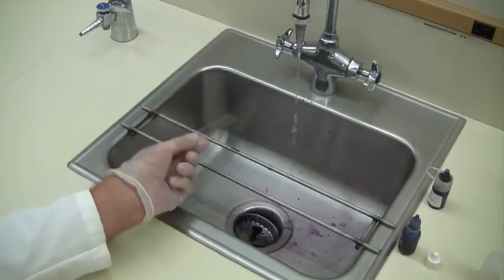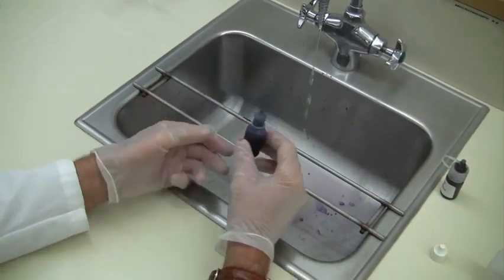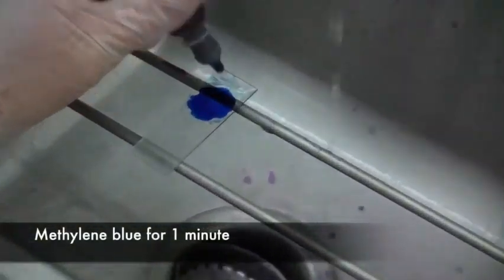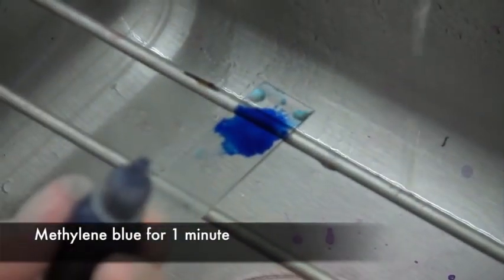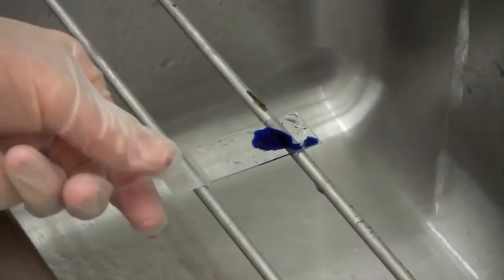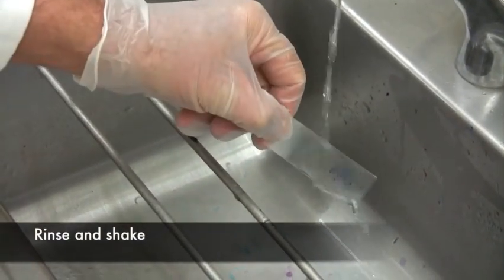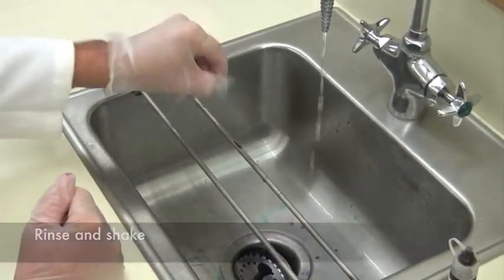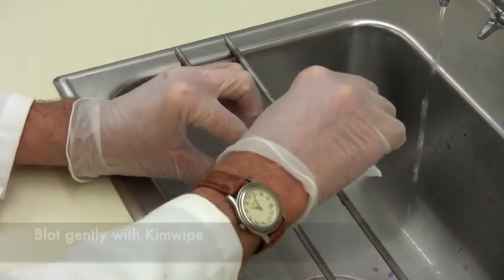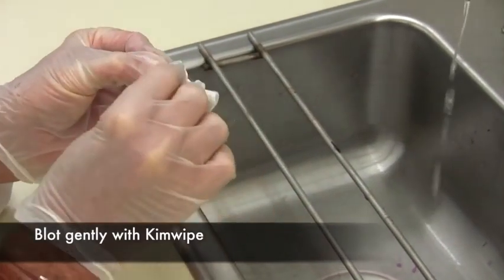And the last step will be methylene blue. You're going to cover the smear with the methylene blue and leave it on for 1 minute. After 1 minute, rinse off the methylene blue from the slide and shake off the excess water, and then blot it gently with a Kimwipe until it's dry.